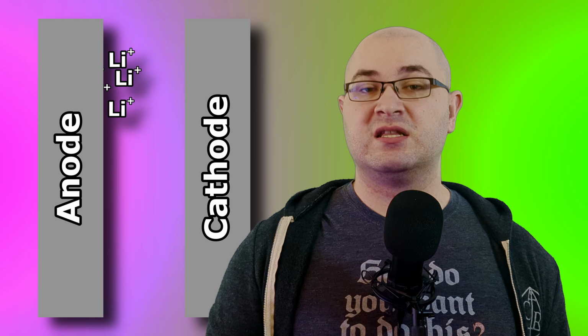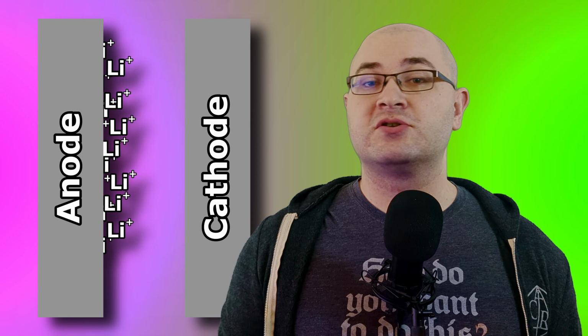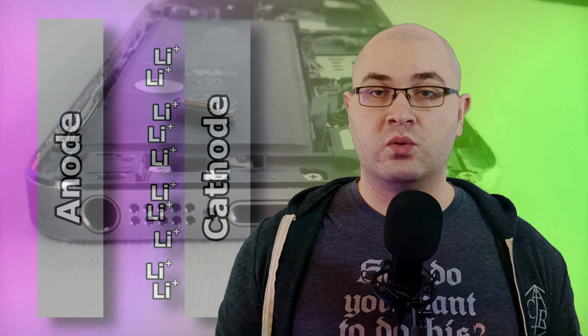A perfect example of the power XAFS holds is in batteries. In the case of a lithium-ion battery, the type of rechargeable battery used in phones and electric vehicles, the battery works by moving lithium ions back and forth between two electrodes. As it charges and discharges, the atomic structure of these electrodes changes, which is what causes them to degrade and eventually die. But you can't see that happening, which is where XAFS comes in. Scientists designed a special electrochemical cell that X-rays could shoot through, allowing them to put a working battery right in the beam and watch what was happening to the atoms inside as it was happening.